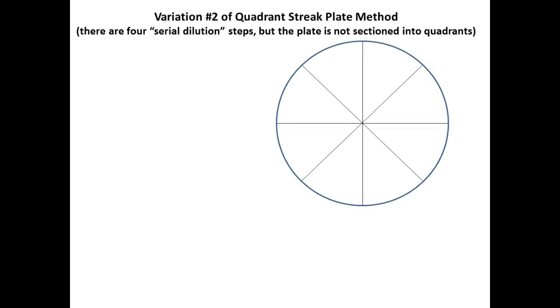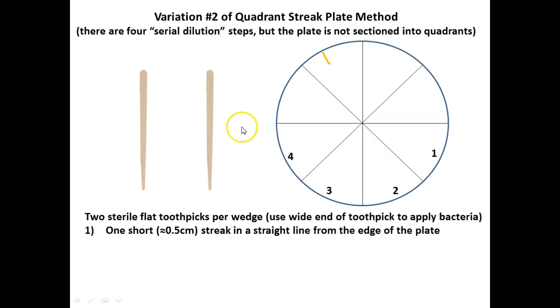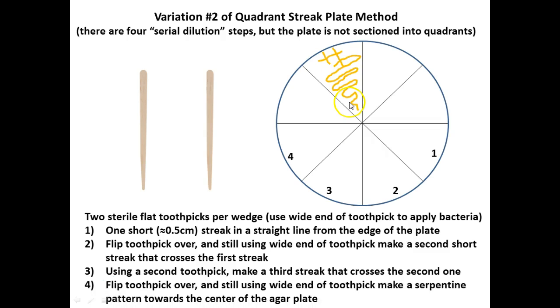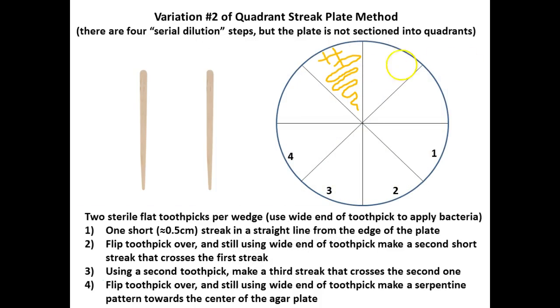So, Peter Hickman worked in a research lab. Again, you don't want to be using a gazillion plates. He would literally divide up his plate into several sections and do little tiny streak sections using sterile toothpicks, right? So he'd literally put one little line, and then one little line, and one little line, and then streak out the rest. So that would be one of his samples, right? And then he would do the same thing for each one of those wheels around that plate. And so he could get how many samples on there? 8 different samples on one plate. Doing it at micro scale.